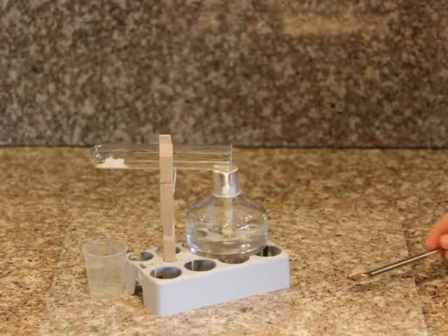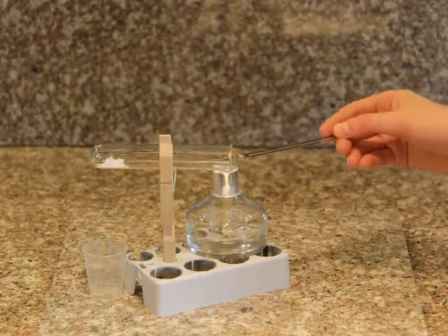Then, place your copper square onto the spoon and carefully place it in the test tube.